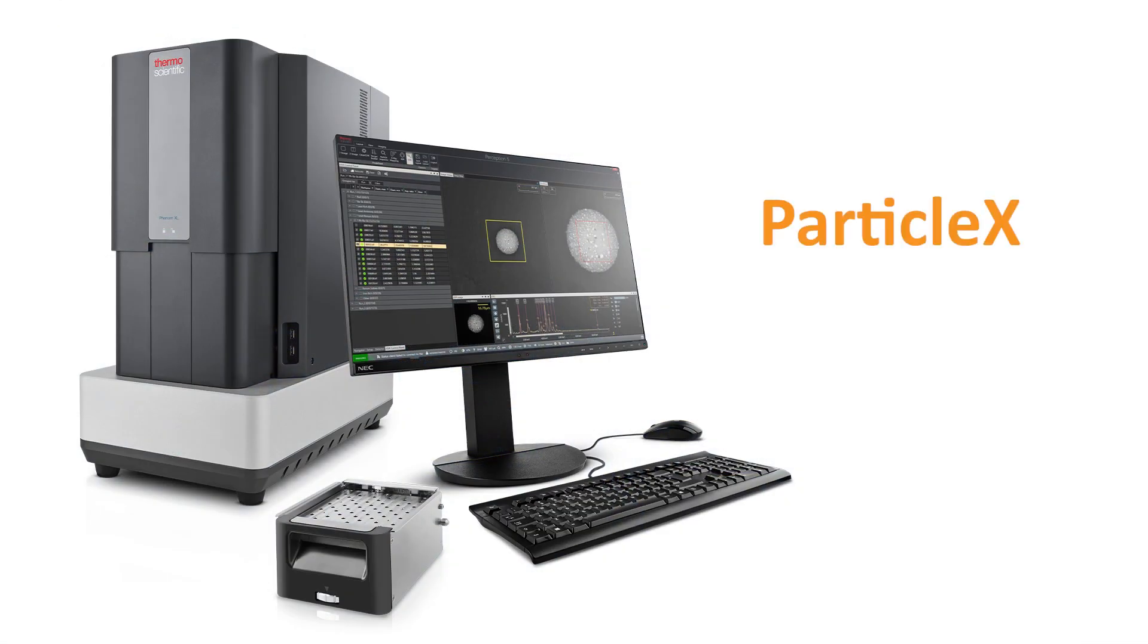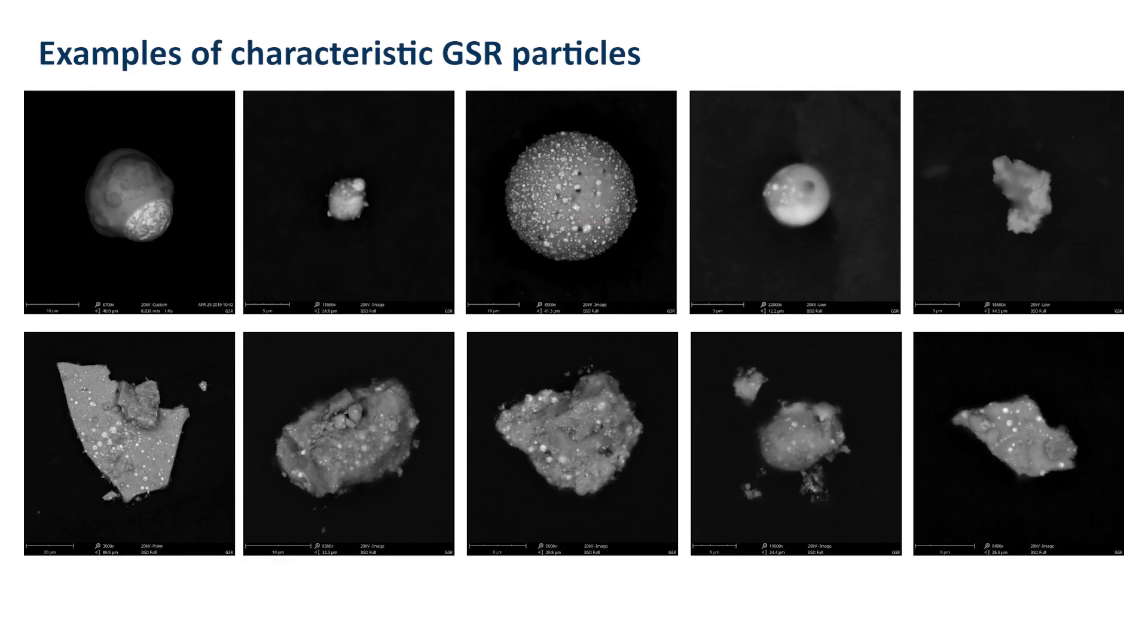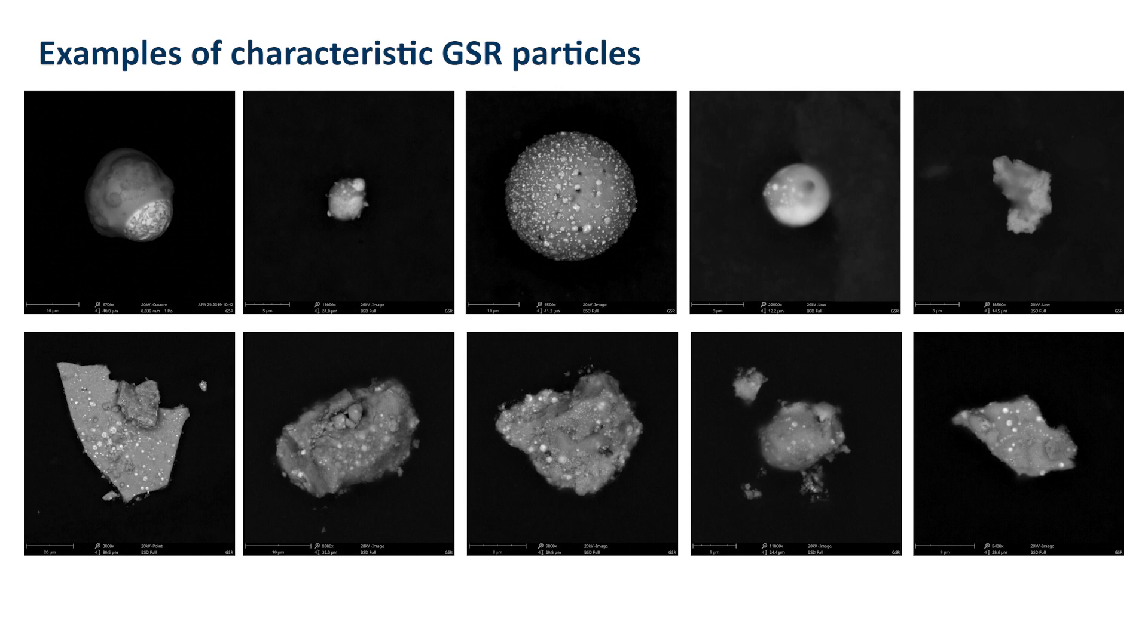The ParticleX software package on the PhenomXL Desktop SEM automatically analyzes particles found on a sample. ParticleX uses the Perception software, used on legacy aspects instruments, to set up the automated runs. This short video will demonstrate how to set up a run properly and go through the data afterwards.